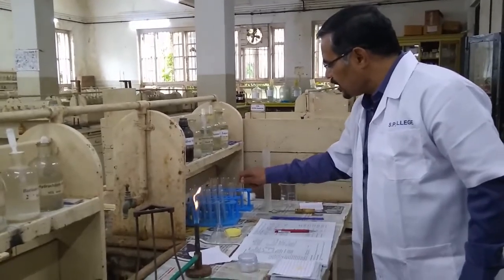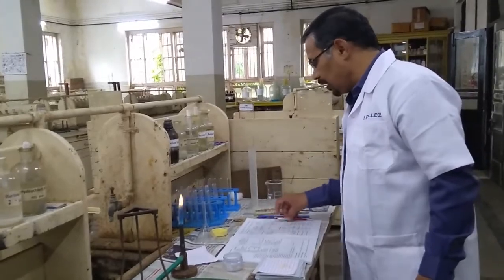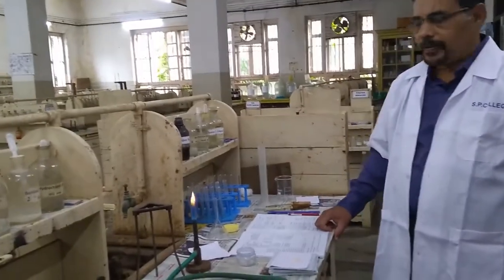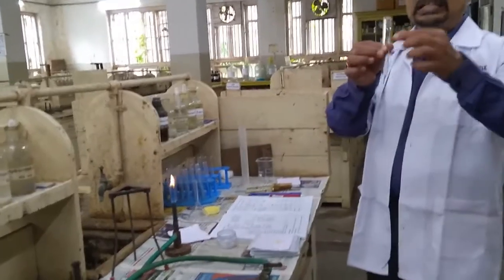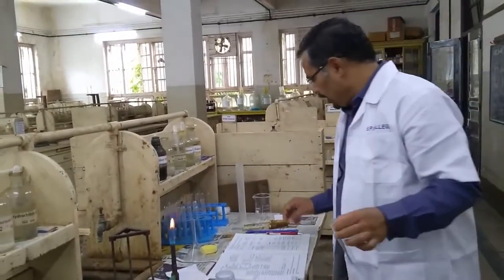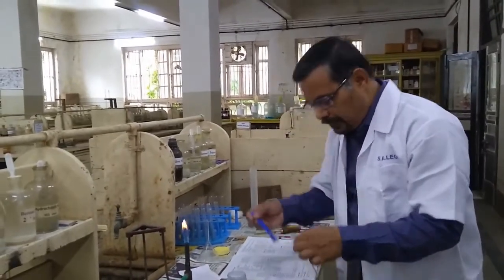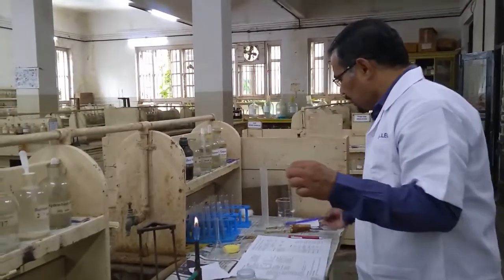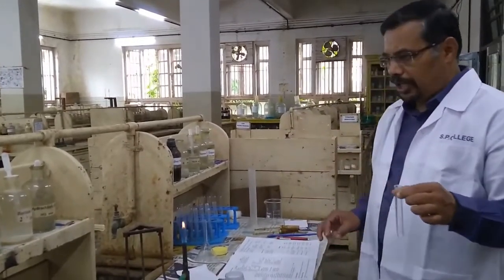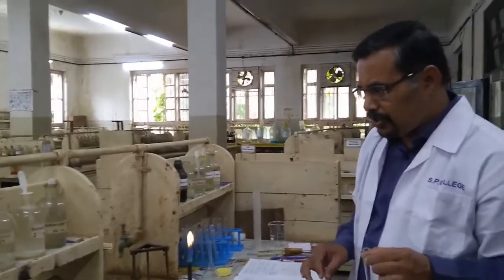Then next test we will perform for the basic radical analysis is action of NaOH. So we will take again one clean test tube. We will take small quantity of given mixture in the test tube. Then we will add small quantity of NaOH, that is sodium hydroxide solution.